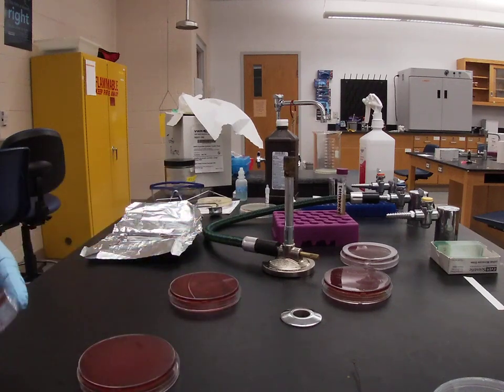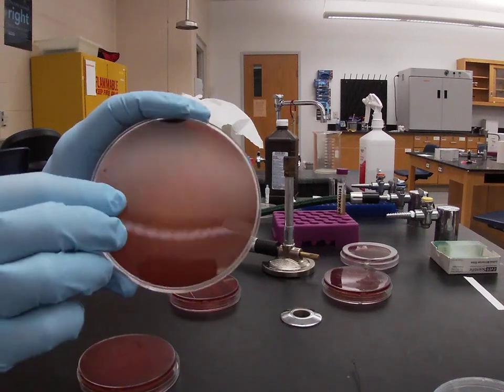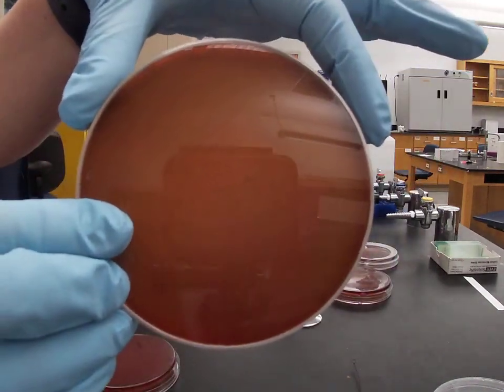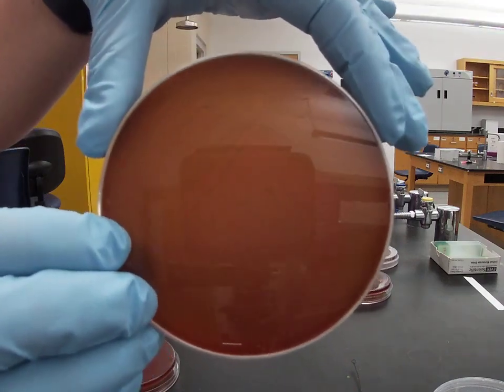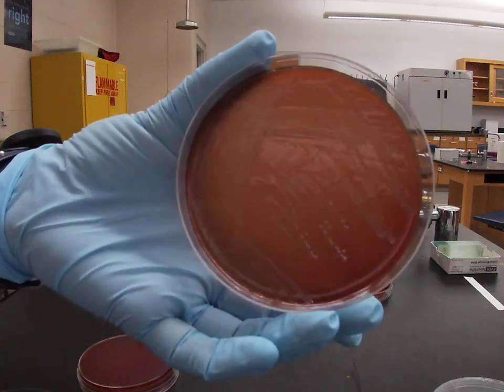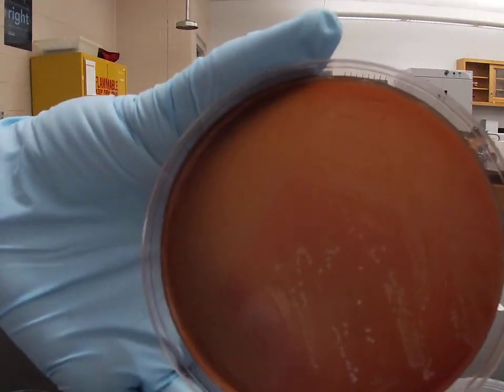Alpha hemolysis is incomplete hemolysis. These bacteria are able to lyse red blood cells, but they can't lyse them with the same efficiency as those that can lyse completely. So instead of seeing clearing on the media, instead the media turns somewhat green where the bacteria are. It might be a little bit hard to see in this video, but I know I have better pictures in the lecture or in the lab PowerPoint, and you can find lots of pictures of this online. So you can see everywhere the bacteria are growing, the media has actually turned green behind them.